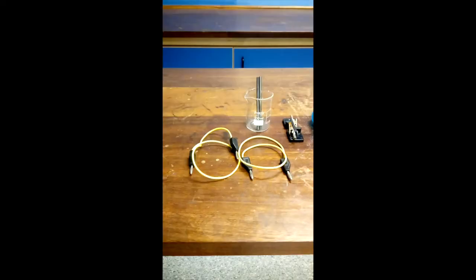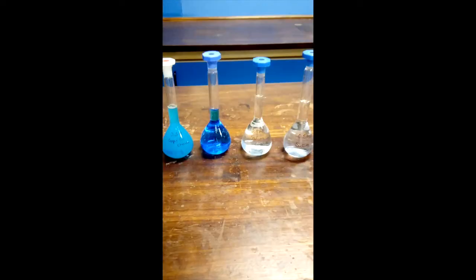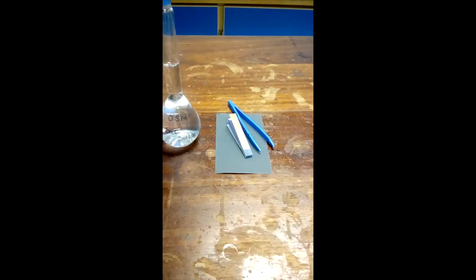You will be provided with the following equipment: a power supply, crocodile clips and leads, 2 carbon electrodes, a 100 centimeter cubed beaker, and something to hold the electrodes in place. 4 different salt solutions: copper chloride, copper sulfate, sodium chloride, and sodium sulfate. Finally, emery paper, tweezers, and blue litmus paper.